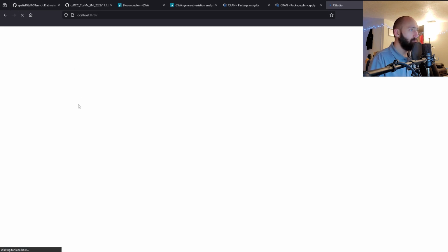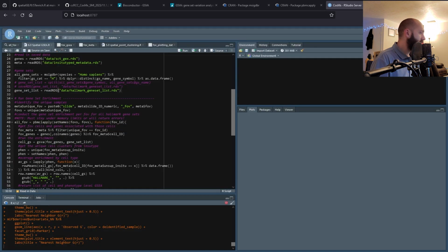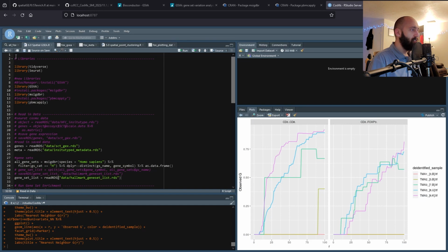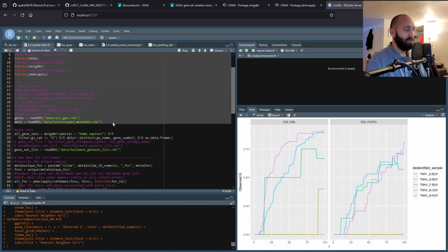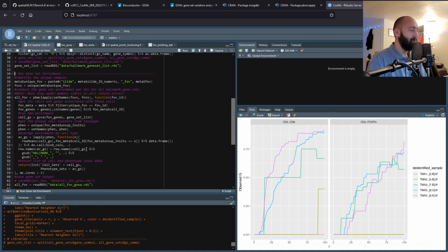Oh, it looked like the R thinking thing might be still spinning up. Our studio session. There we go. So we'll go ahead and do this, and then we'll read this in, and then I can continue talking.